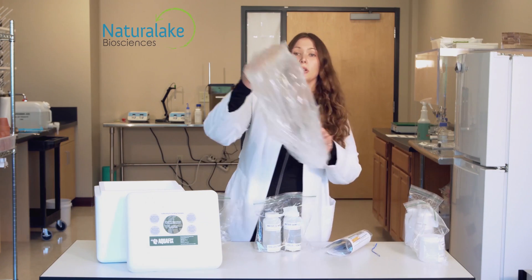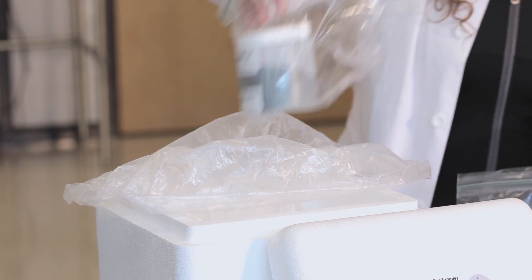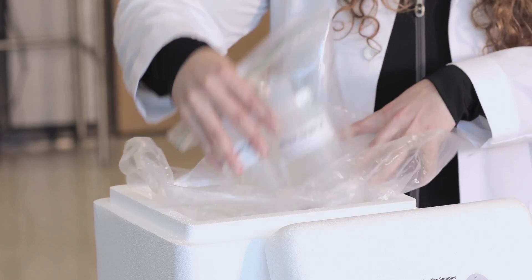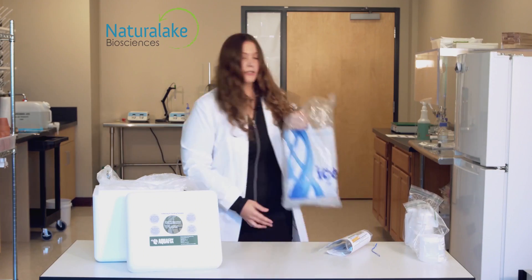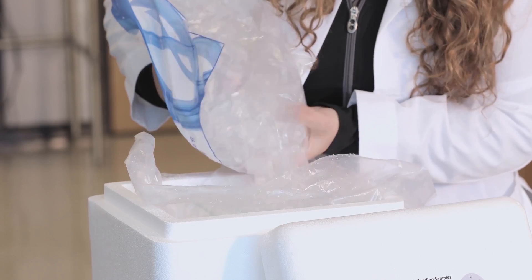Place the cooler liner in the cooler. Place your sample bags upright within the center of the liner bag. Fill the cooler with ice, making sure to have samples remain upright and cover completely.